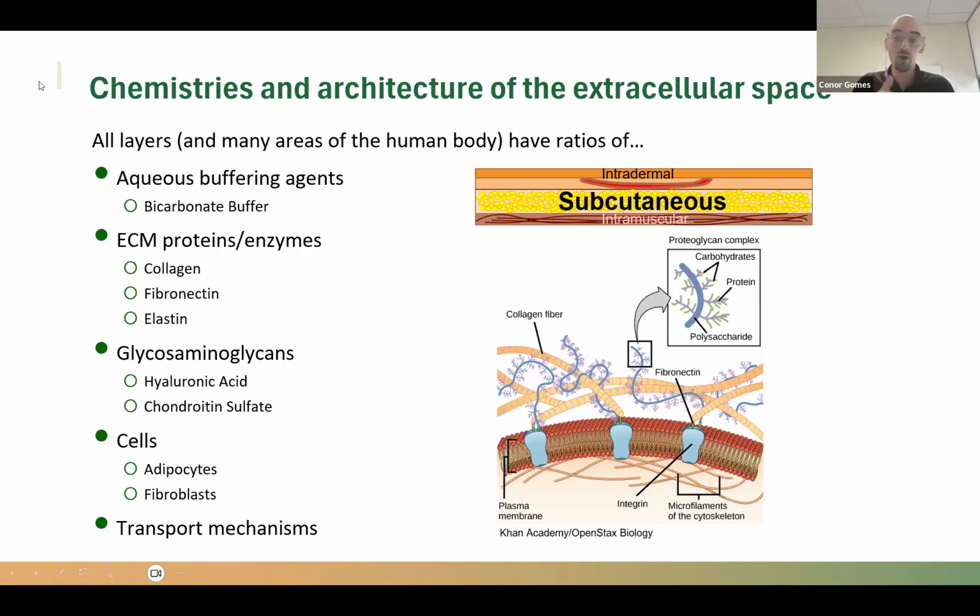You may sample off. So as I mentioned, fluorophores sometimes can be picked up in the UV-vis region from secondary spectroscopic processes. So it is possible that if you do have a fluorophore, that fluorescent tag can still be detected via UV-vis. I'll just say that one anecdotally. But no, we do not have integrated in the scissor or rainbow a way for you to do a fluorescent-based imaging assay. That would have to be done offline via auto-sampling from HPLC.